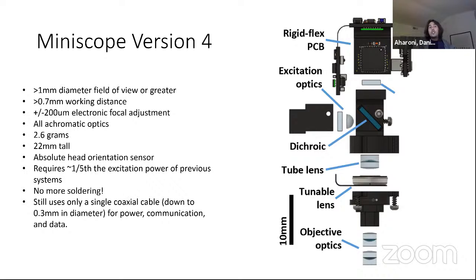But some key components of this newer generation Miniscope is we really took a step back from what we had developed in the past and the standard design of miniature microscopes, and tried to address some fundamental limitations in that design so that we have a base platform to design around for all of our new ideas. So this is smaller and lighter than our previous generation, while increasing the field of view substantially, which we'll see in a second. In our older microscopes, you could adjust the focus in the brain, but it was a mechanical slider you had to move. These new systems all now use electrowetting lenses. So through software, you can adjust the voltage on the lens and it adjusts the focal plane for you in a very repeatable manner.